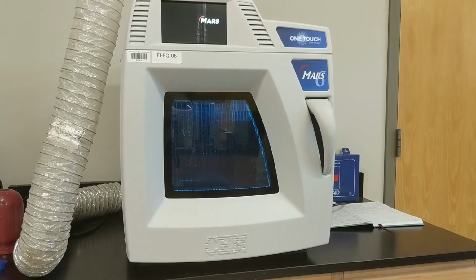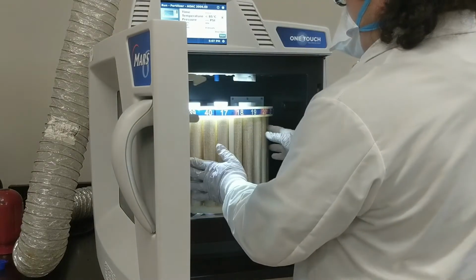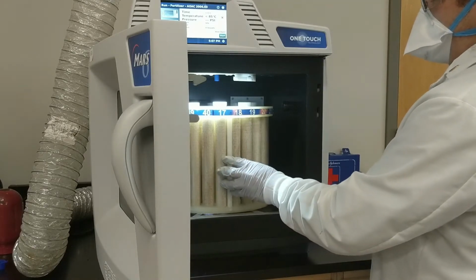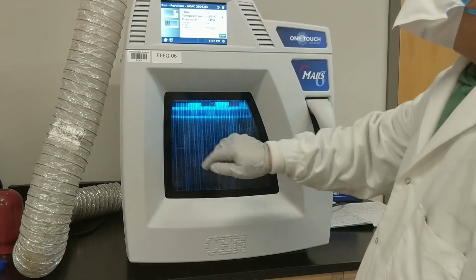Once we have the vessels tightened and in the carousel, we can now add the carousel into the microwave. You can see it goes in with the number 1 and the number 17 facing the front, and it shouldn't move much if you try to spin it.